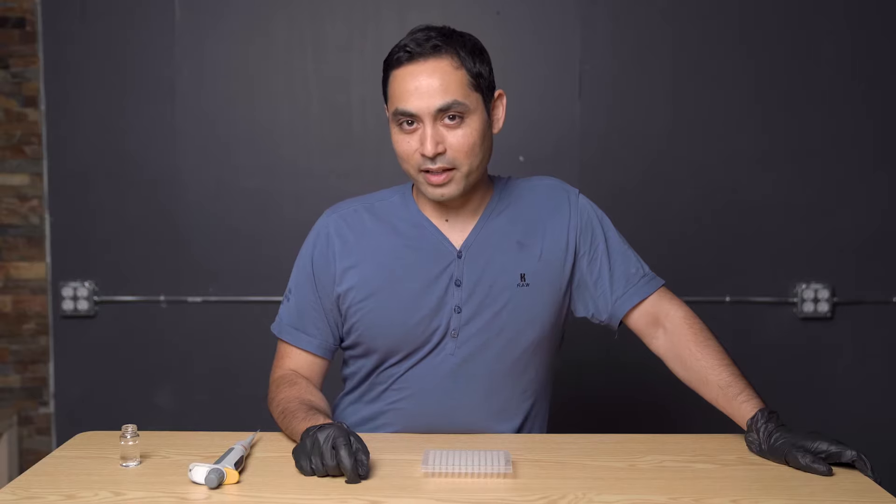In this video, we're gonna be talking about proper pipetting techniques.